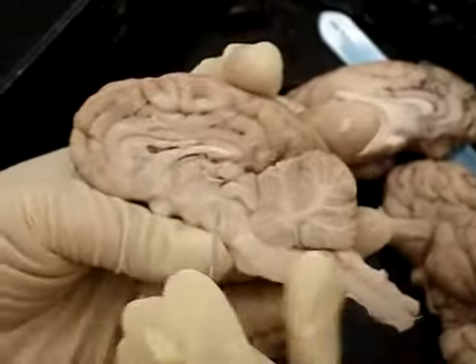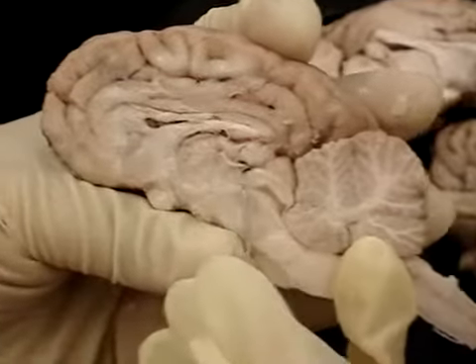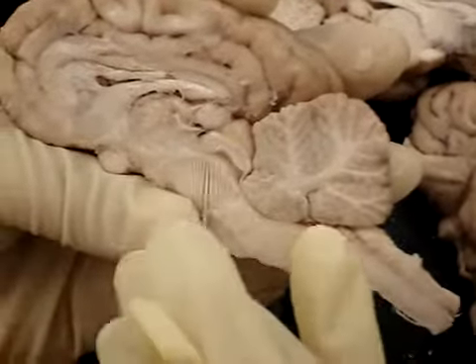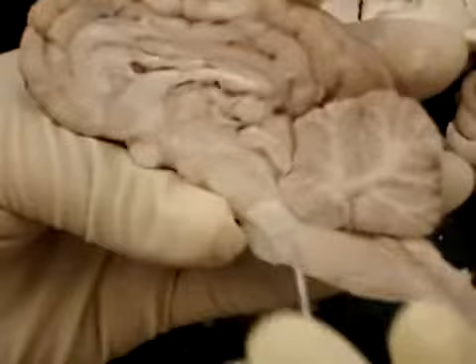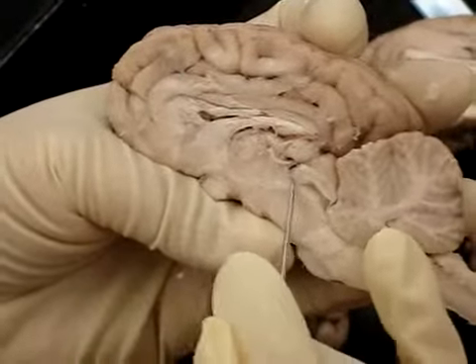The aqueduct is actually the cerebral aqueduct, and it goes from the third ventricle. It connects the third ventricle and the fourth ventricle. It's this one. This is the cerebral aqueduct. Runs down here. The inferior colliculus, this is the sagittal view. This is the inferior colliculus. So there's the cerebral aqueduct.